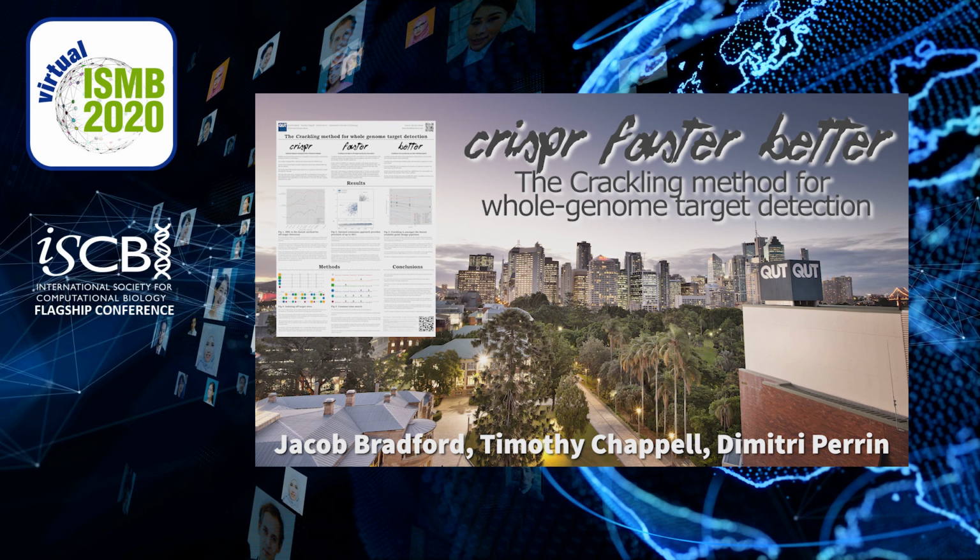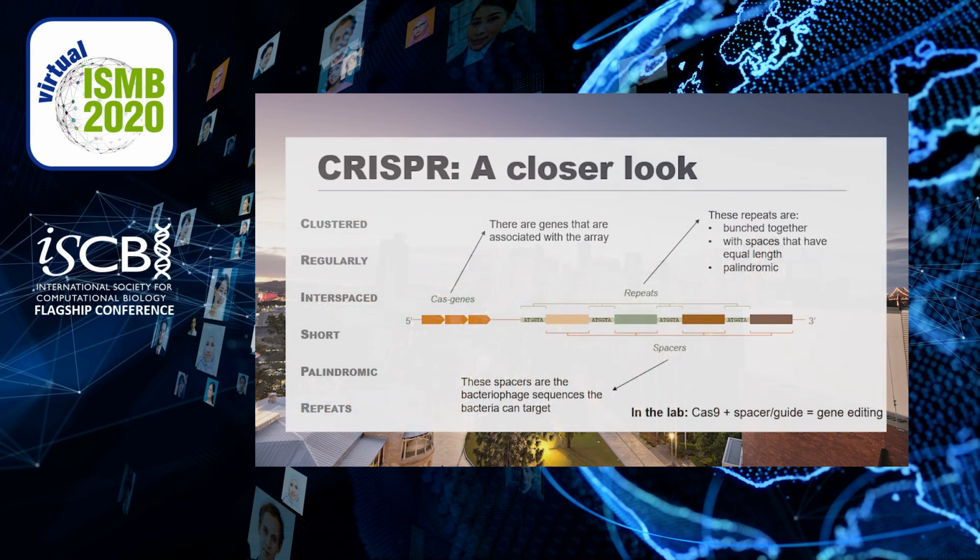Thank you for connecting into my poster presentation on my work in developing Crackling, which is a fast and accurate method for designing CRISPR guide RNA sequences. I would like to acknowledge my colleagues involved in this work, Dr. Timothy Chappell, and my PhD supervisor, Dr. Dimitri Perrin.